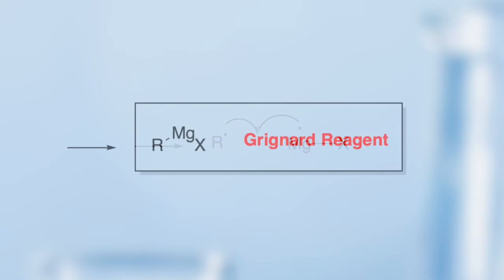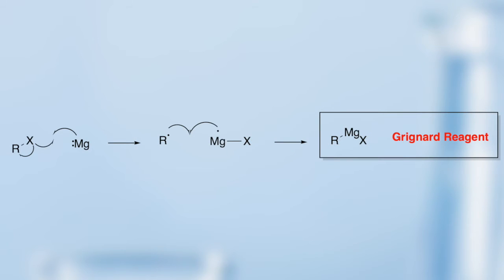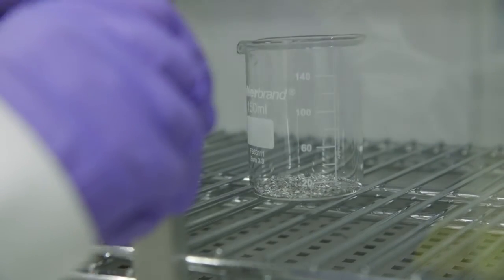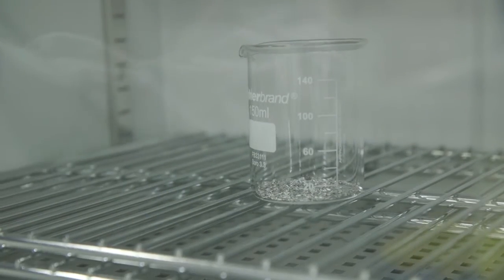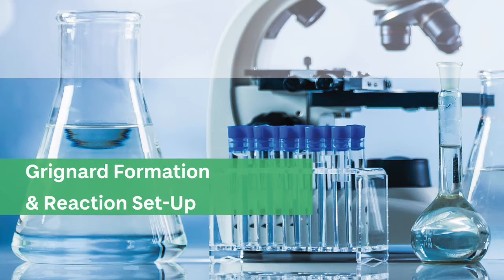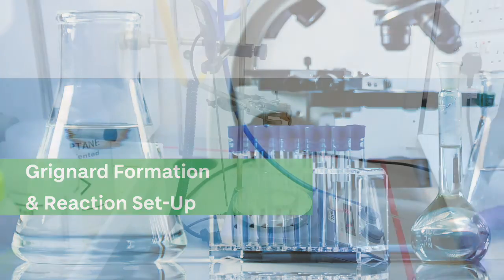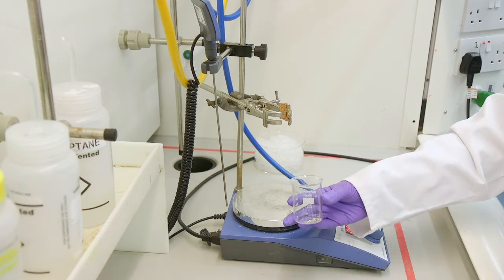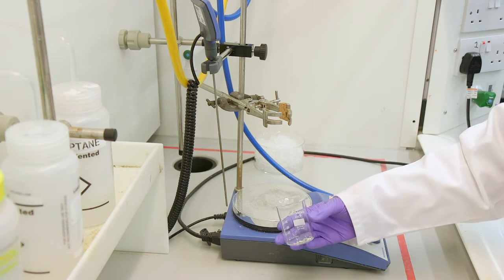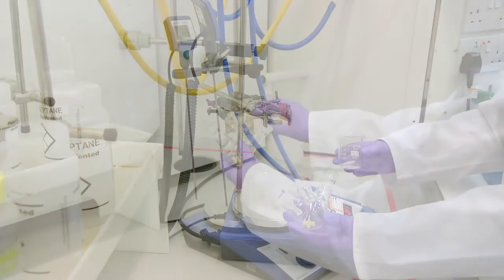In an ideal scenario you want your magnesium to be as activated as possible so that it will insert into that carbon halide bond to make your Grignard. If possible you should put the turnings that you want to use in an oven overnight beforehand and then take them out. So here are my magnesium turnings from the oven. We will add the pre-weighed amount to our multi-neck round bottom flask containing a stir bar.